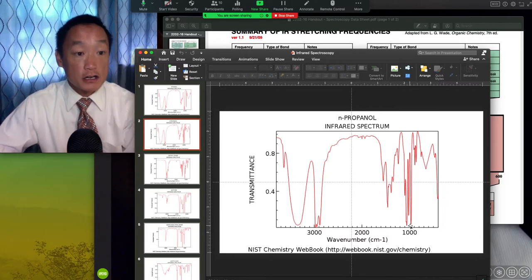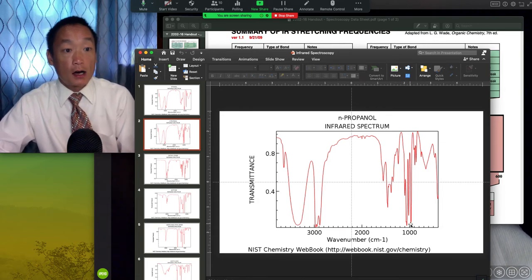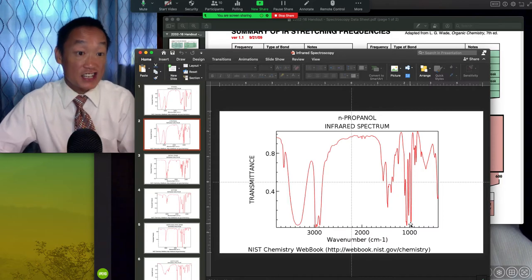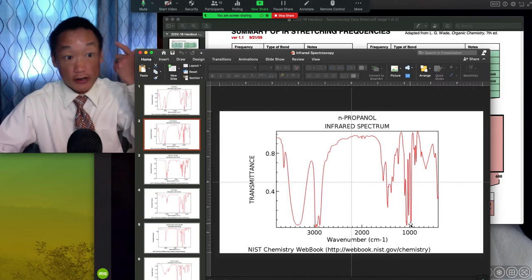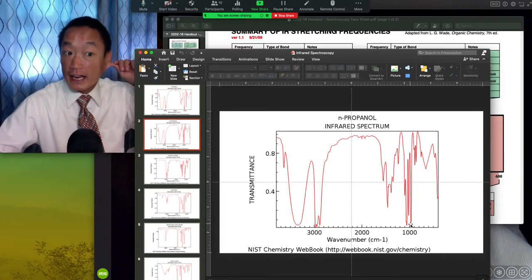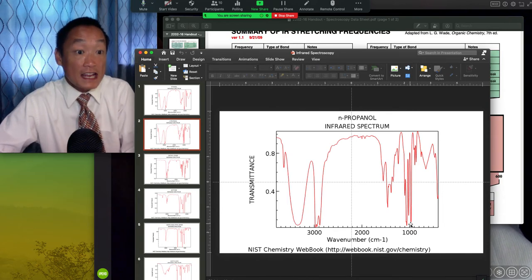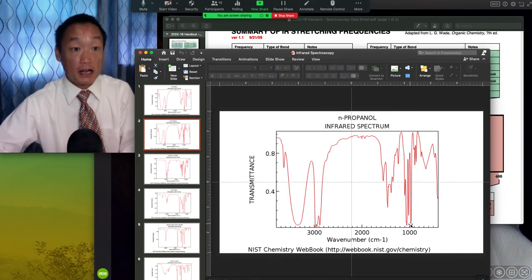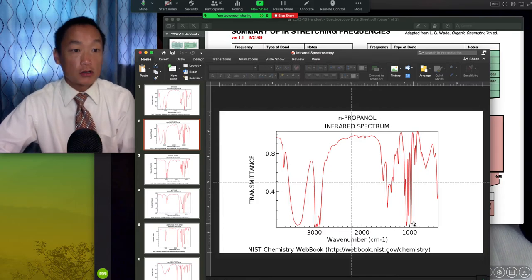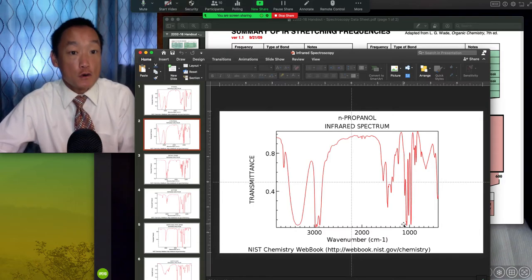The same idea would be like if you took a CAT scan of a brain, let's say, and at that point in time when you took that CAT scan, you also got the scan of the ears because they're attached to the head at that point. You wouldn't be looking at the ears for a diagnostic confirmation of a brain tumor because it's just not the area of the scan that's going to be diagnostic in determining a brain cancer. And so you wouldn't look at that portion. You're not going to look at this portion to be diagnostic for anything because it's just too busy.